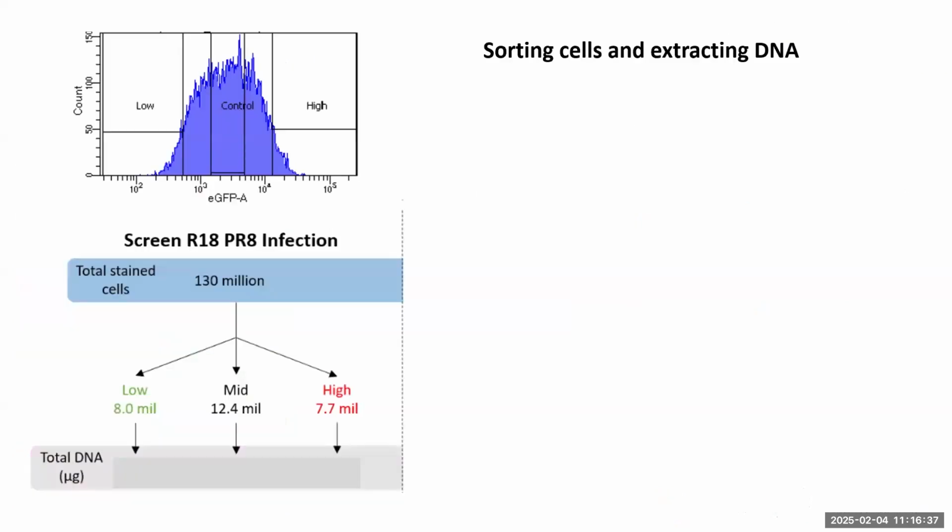So we then get to the stage where we're looking to actually do the flow cytometry on your cells. You've transduced your cells, you've selected the cells, you've got rid of the non-transduced cells with the puromycin, and then you do the flow cytometry. In these kinds of assays, there tends to be a lot of optimization at that stage. I'm not going into it here because it tends to be very specific for whatever screen you're doing.